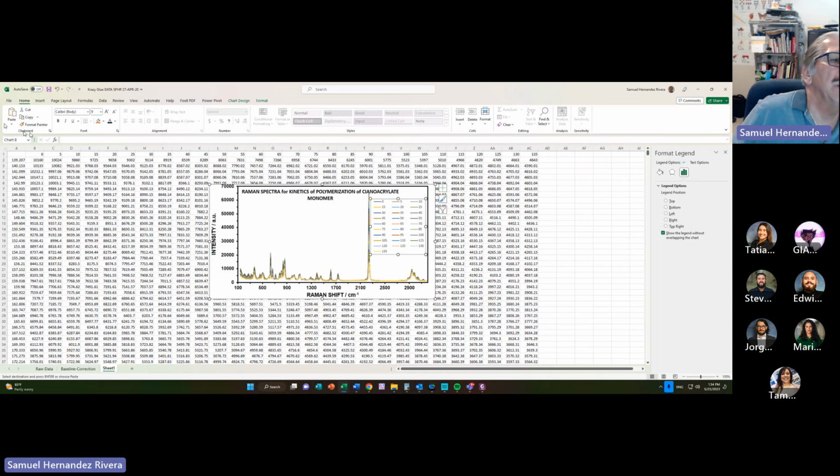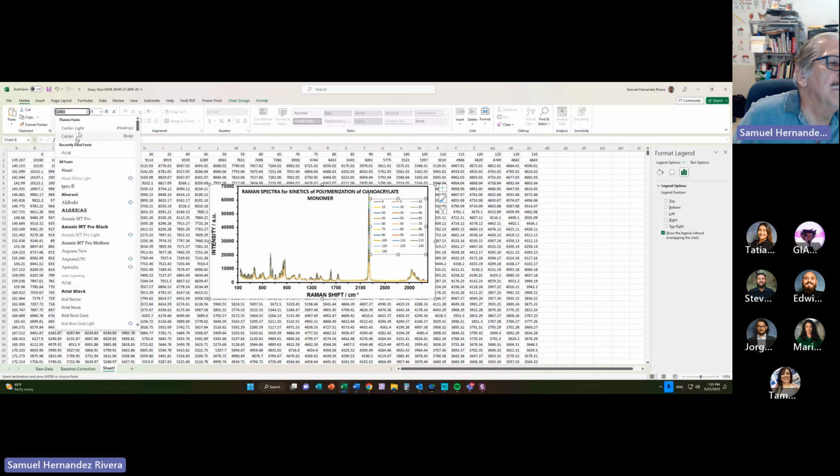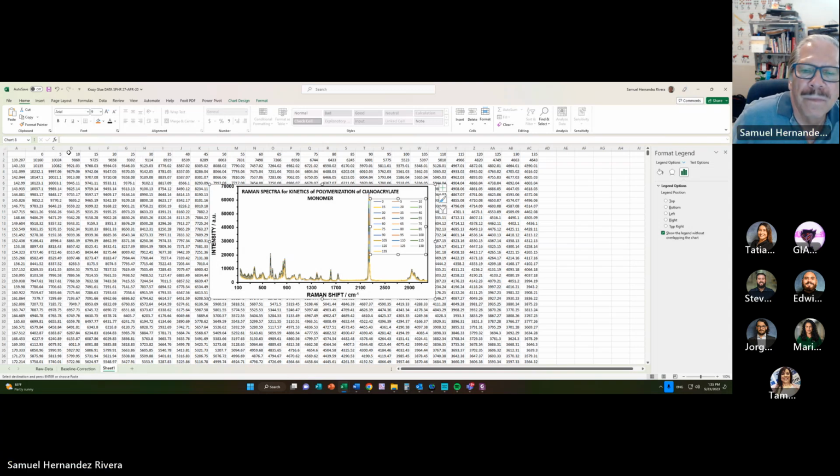That also should be in very dark color and should be in Arial. Just wait. And in bold. Just wait. And let me change the font size to 10. We will have, yes, done now.